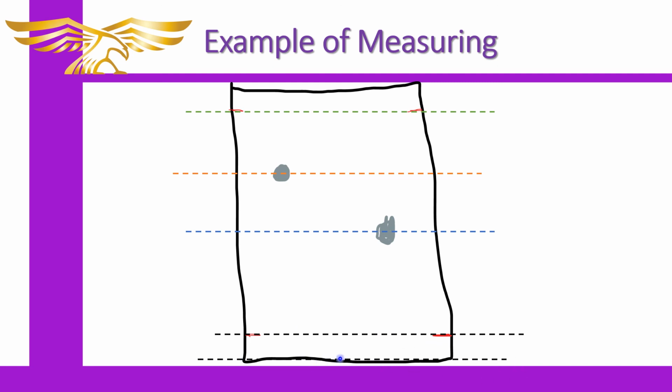So you can either begin at the very bottom of the plate and measure up to the midpoint of the spot for the particular compound, and then measure from that same point up to the solvent front line, or you can start from where the solvent began, which would be at the spotting line right here, measure up to the midpoint of the compounds, record that distance, measure up from here on this line to the solvent front line, and then take it as the ratio that it's meant to be.